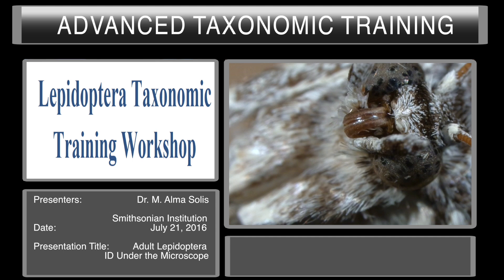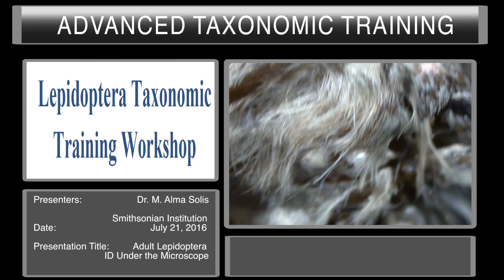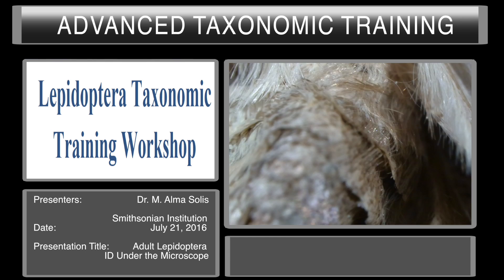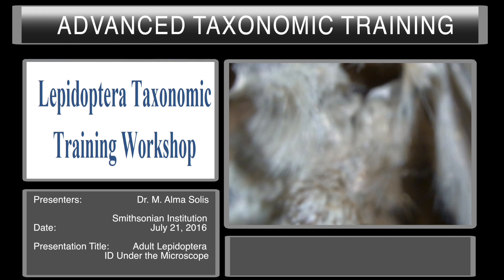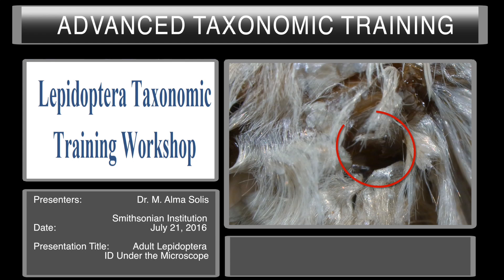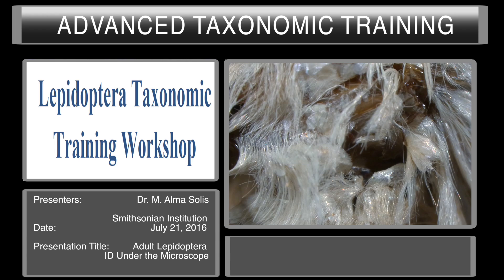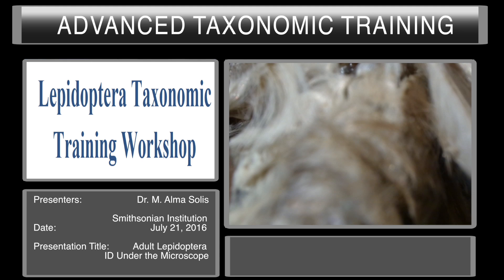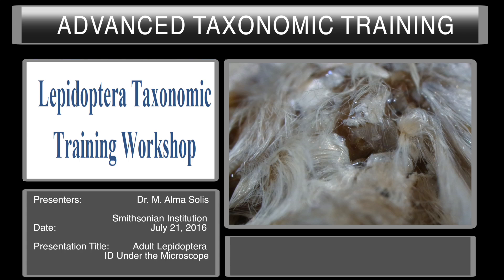So we have the noctuid. This is a beautifully cleaned moth — you can see there are no scales, it's very smooth. And then you will look laterally between the metathorax and the abdomen. You can see that there is a very complicated tympanum organ right in here. See this little hood on the abdomen? And then if you turn the moth just slightly, you can see the more complicated thoracic part of the tympanum organ. All of these can be seen by removing the abdomen, and if you do that, it's best to put the abdomen in a glycerin vial to keep it with the moth.